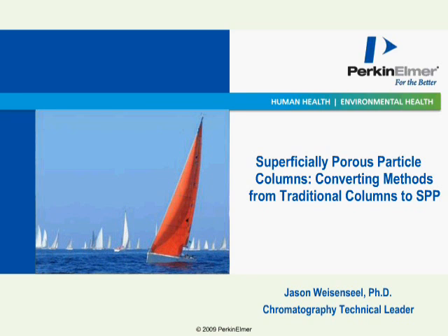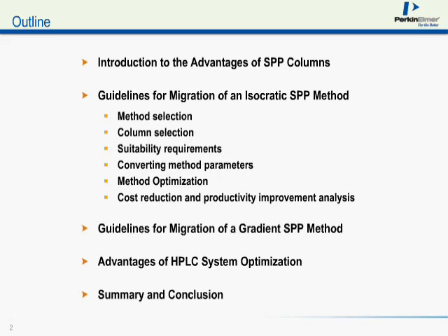Today's presentation is basically on superficially porous particle columns. A lot of times you'll hear these referred to as solid core or fused core type columns. What we will cover today is basically an introduction to these types of particles for HPLC and their advantages, and then most of the presentation will be on how to migrate a method from a traditional fully porous particle type column to one of these new SPP columns.